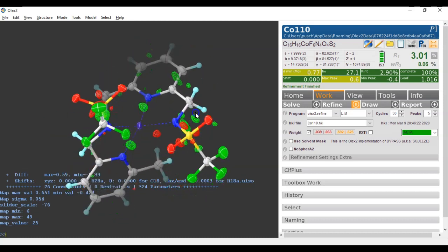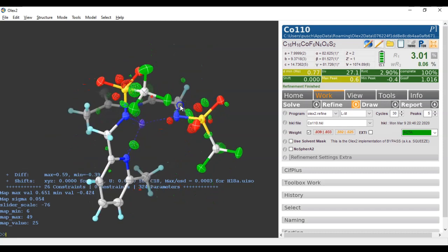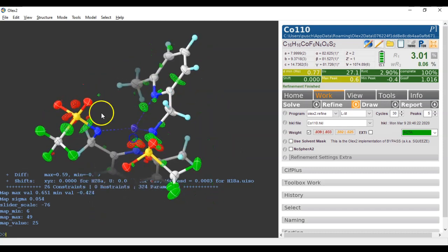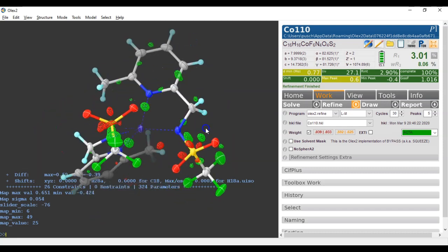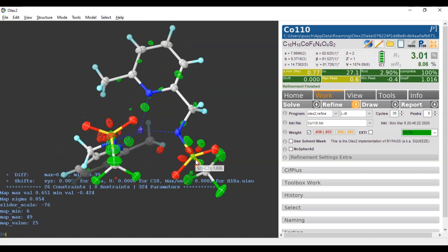So let's see whether we can tidy up these sulfurs as well. I am selecting both of those sulfurs. The up key to repeat the previous command. Refine this again.